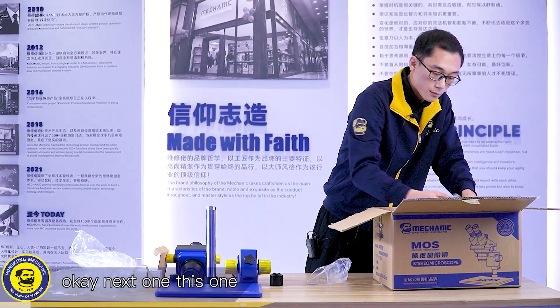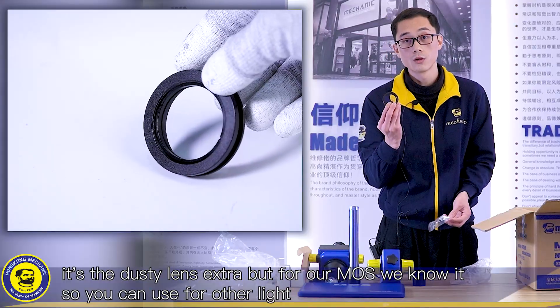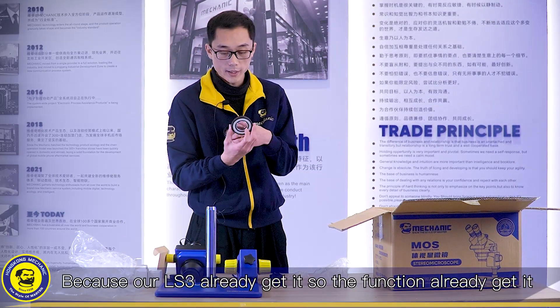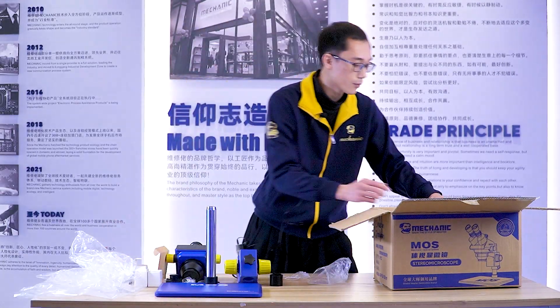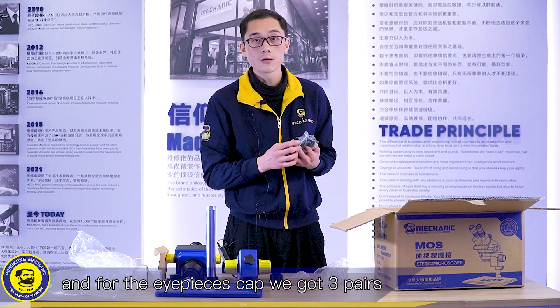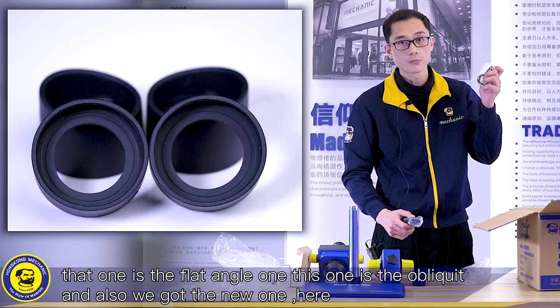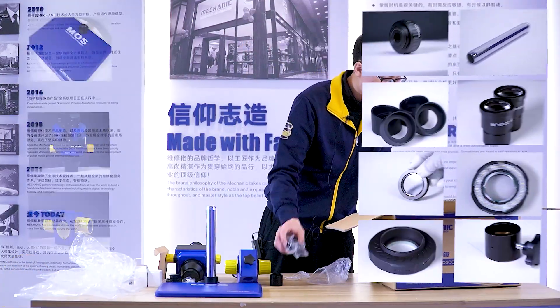This one is the extra dust lens, but for our MOS, the LS3 ring light is already equipped with one, so you can use this extra one for other lights. For the eyepiece caps, we have three pairs: one is the flat angle one, this one is the oblique style, and we also have the new one here.